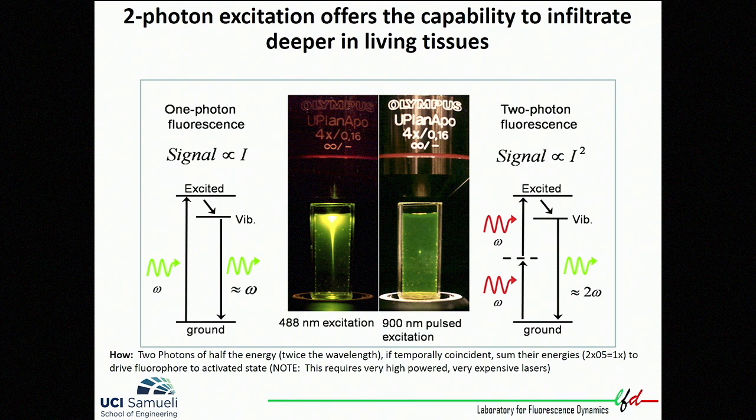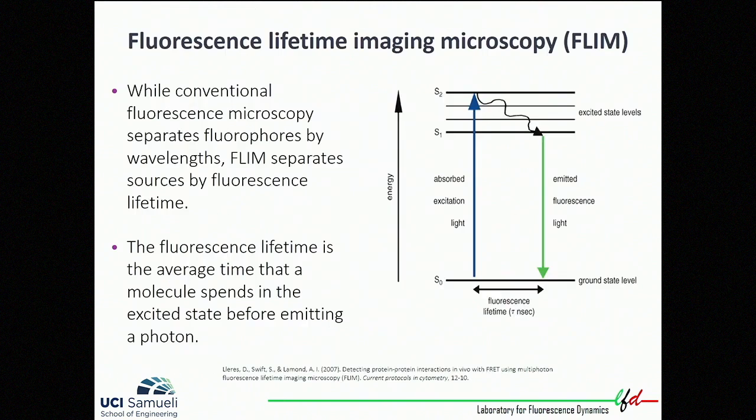Not just that, but the type of laser that is used is the pulse laser. And so we are able to generate a very small focal volume, as you could see here, without actually illuminating above or below the focal point, which allows us to go deeper in tissues. And so for two photon excitation, we generate a high density of photons at the focal spot. And if we have two coincident photons, they can excite the electrons for us to be able to excite the intrinsic fluorophores inside the tissue.